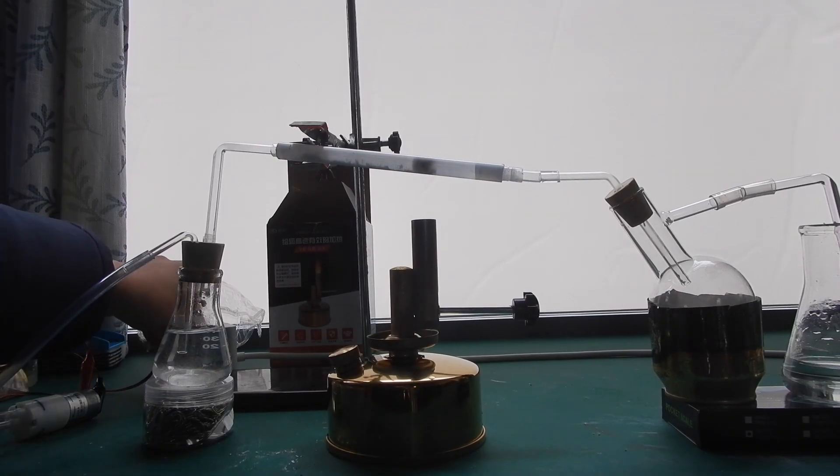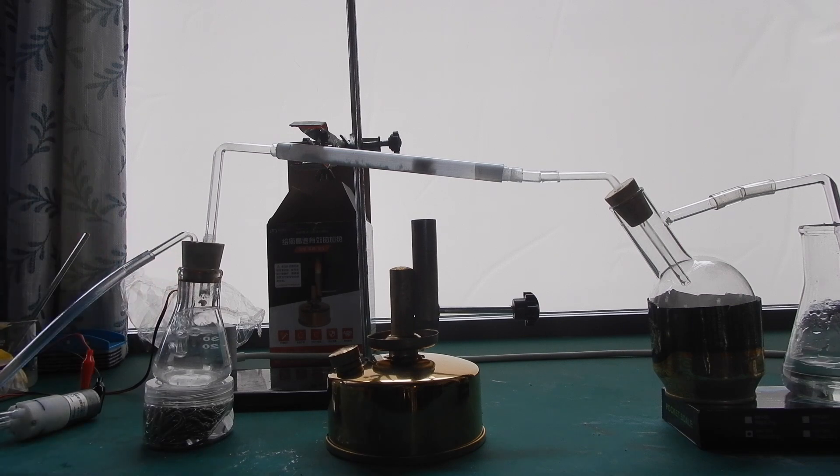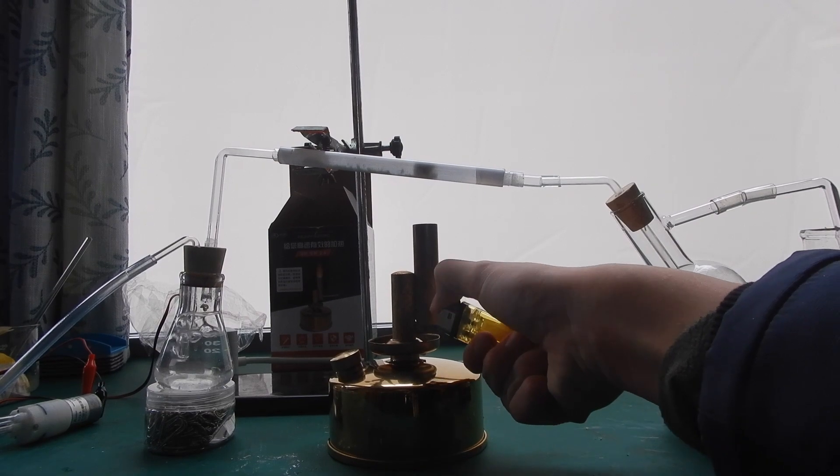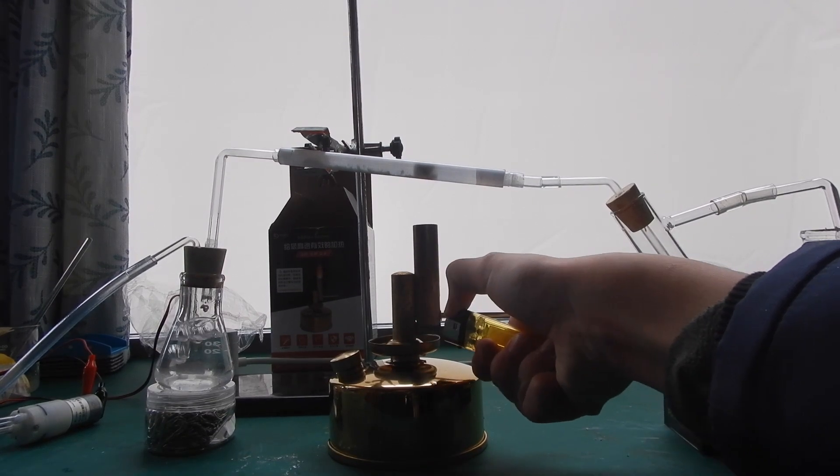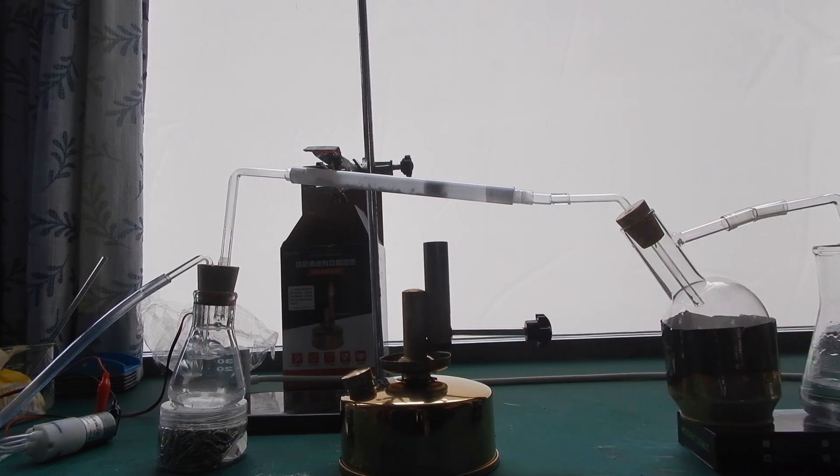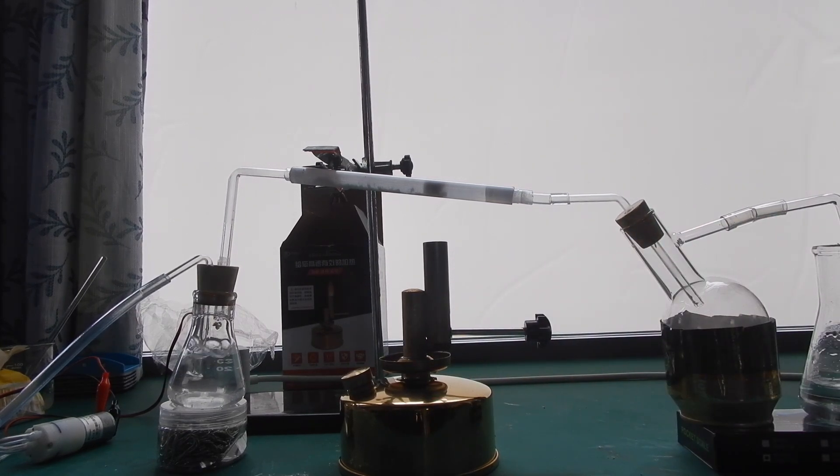Now we can start the reaction. Switch the pump on and heat the catalyst. I used an alcohol burner instead of the alcohol lamp, since an alcohol burner can do something like 1000 degrees, but an alcohol lamp can only handle around 500 degrees. You can also use a butane torch.